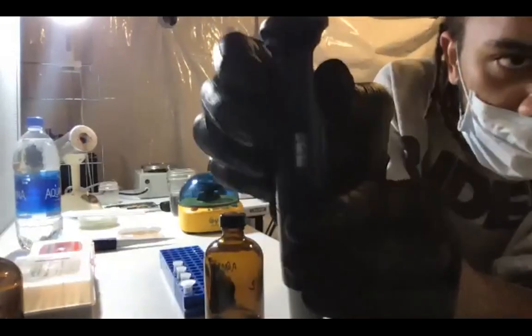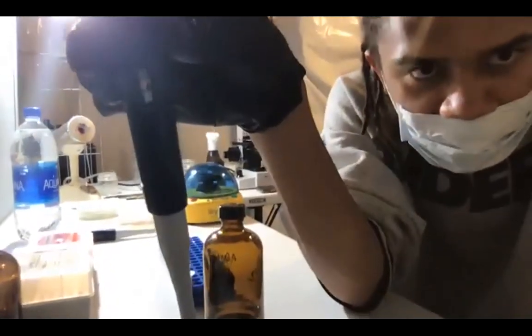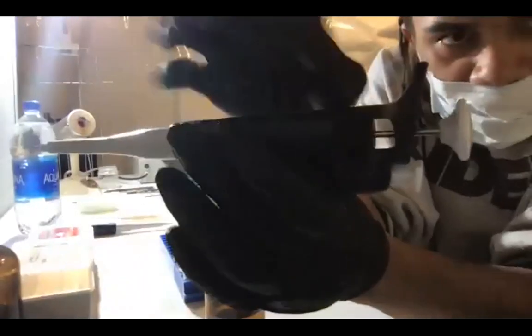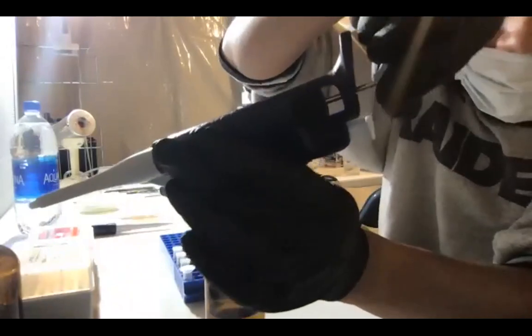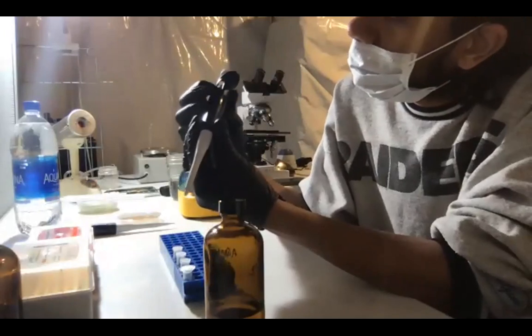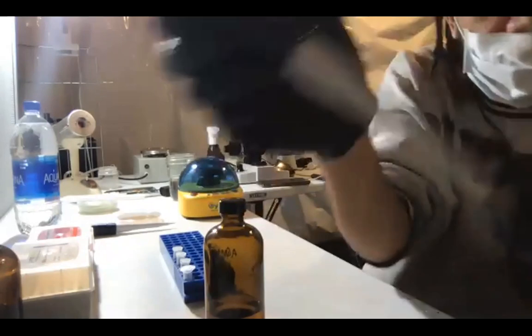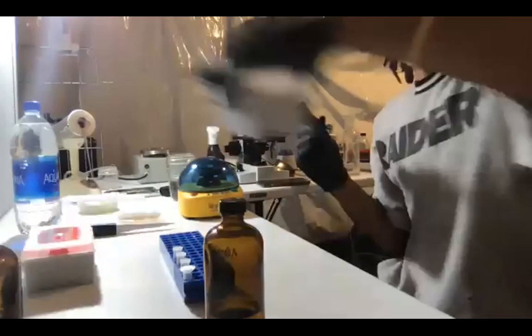So I'm gonna take my pipette. It might be hard for you to see because the light's behind, but there's a little knob on your pipettes right here. Some of them you can just do this. You can do this with this one too, just twist the top. But you're gonna wanna turn it to 100. All right, so I have it exactly at 100. And I'm gonna put a pipette tip on it, and these pipette tips go up to 200 microliters.